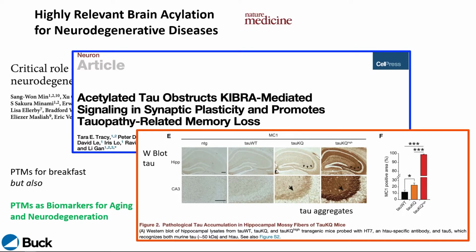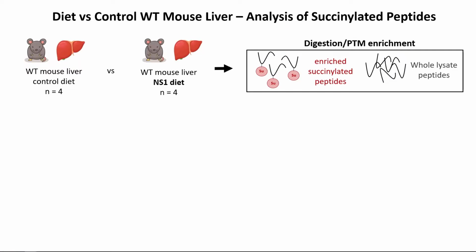So, what do you do with PTMs? Why are they relevant? And I just wanted to show you one extra example. We're really interested in biomarkers, using PTMs for biomarkers. But let me show you in the last 3-4 slides a study that we did, which is really interesting.